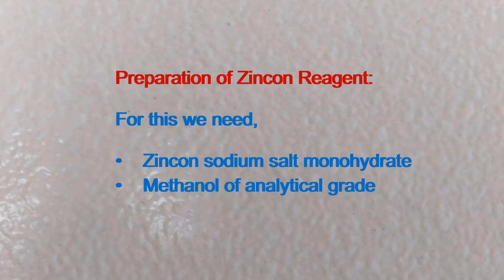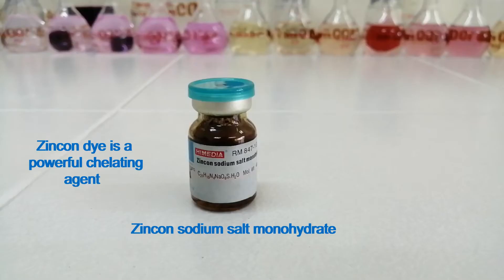This video contains preparation of Zincone reagent. For this we need Zincone sodium salt monohydrate and methanol of analytical reagent grade. This is Zincone sodium salt monohydrate.